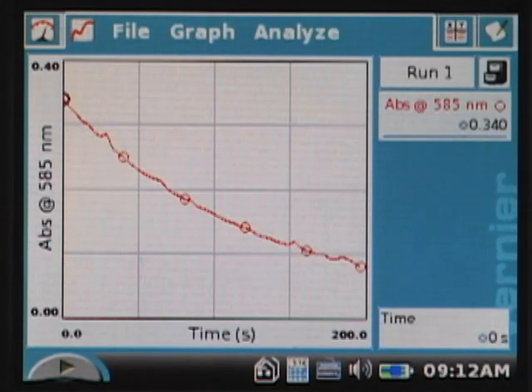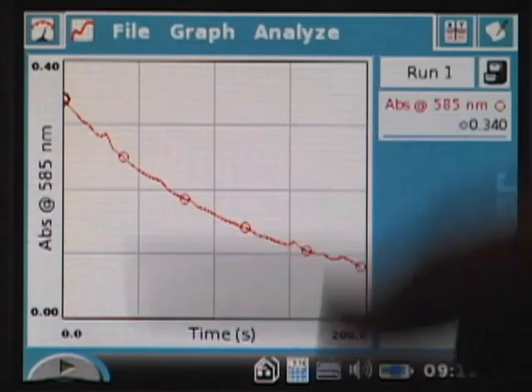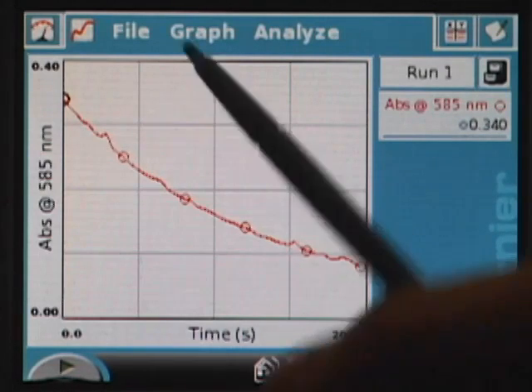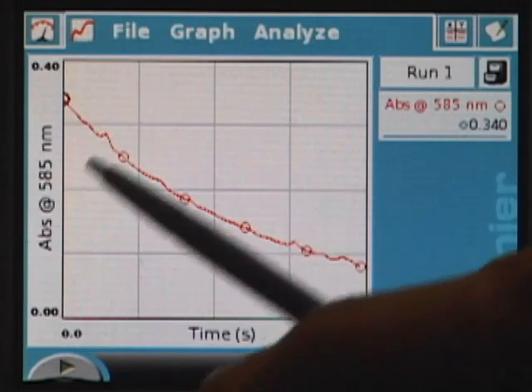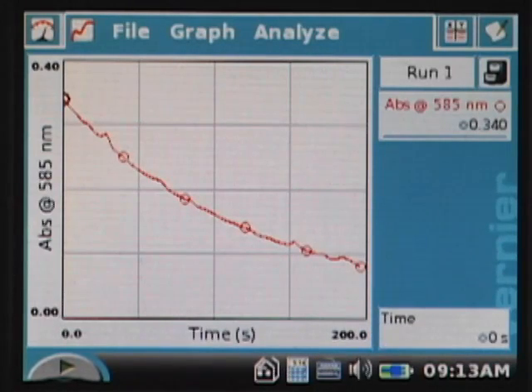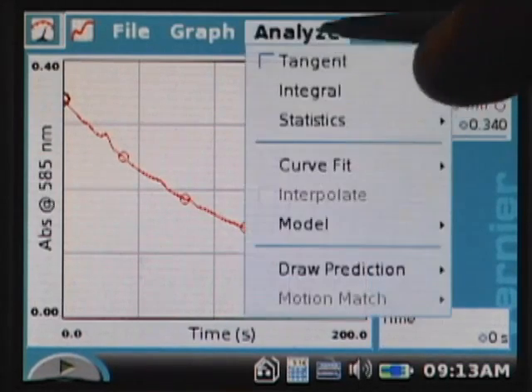The graph is auto-scaled and we're now going to do some further analysis, which is the type of thing a student would do for this experiment. Notice that absorbance is plotted on the y-axis. The method assumes absorbance is proportional to concentration — Beer's law — so we can think of absorbance as a concentration value and we're looking at concentration versus time. If this graph were linear, that would indicate the reaction is zero order with respect to the crystal violet reactant, but it's clearly not linear.